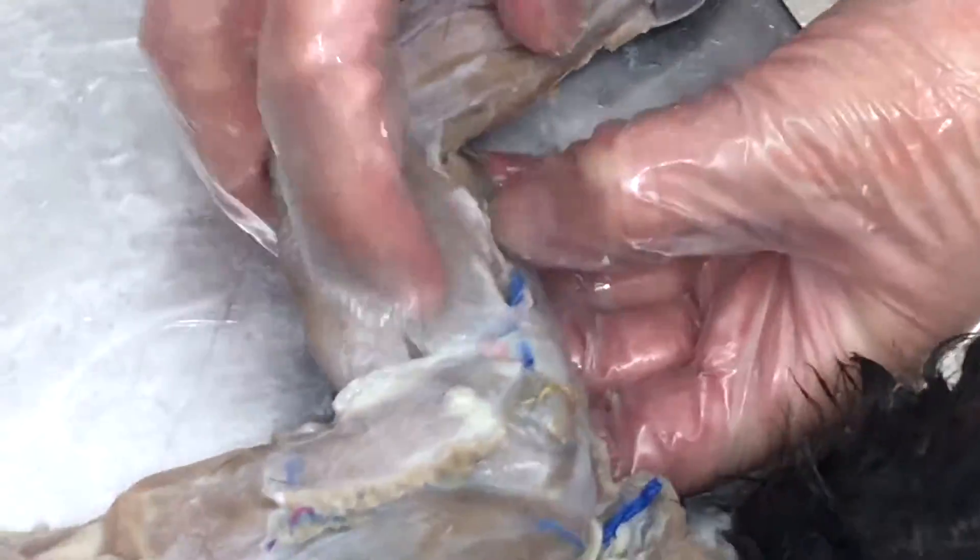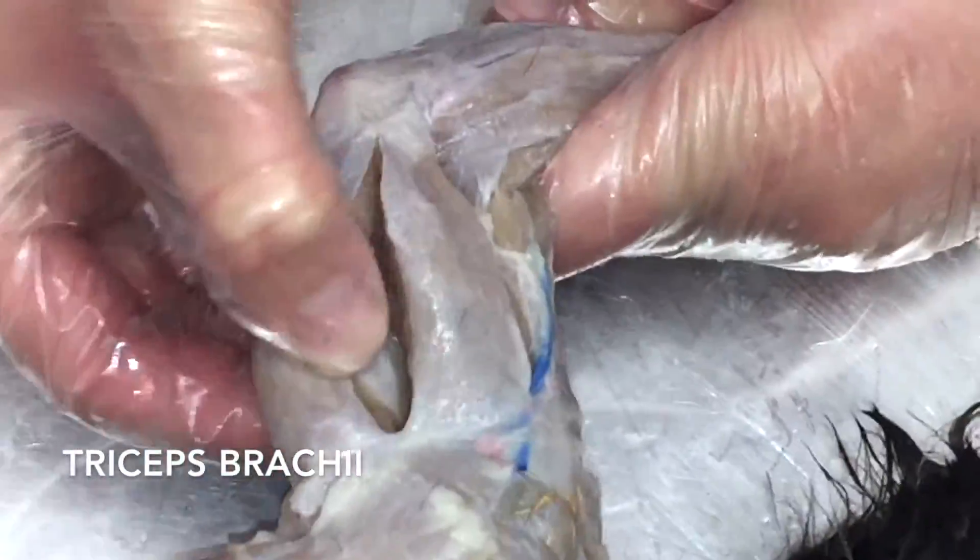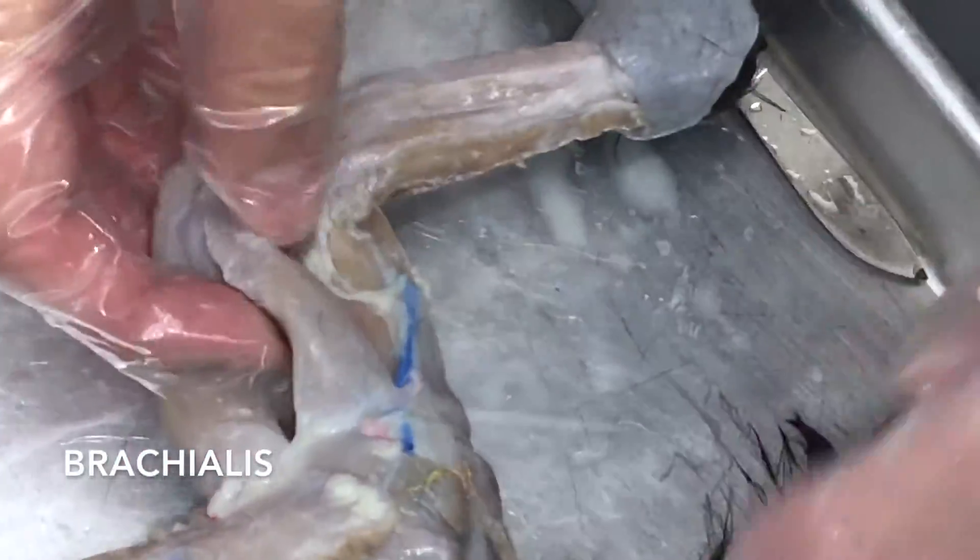Moving down the arm, there are a couple of muscles you can see from the back of the arm. This big, huge muscle here is going to be your triceps brachii. This one in the middle is going to be the brachialis muscle, and then we have to flip it over to see the bicep muscle.